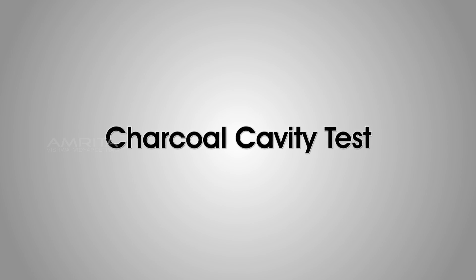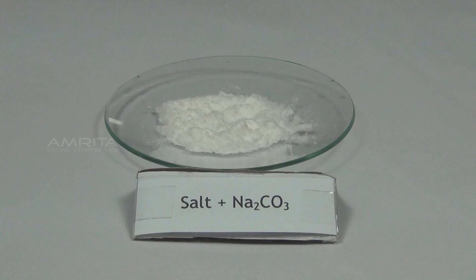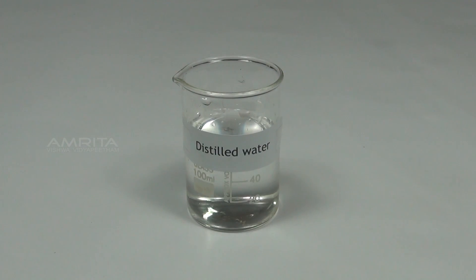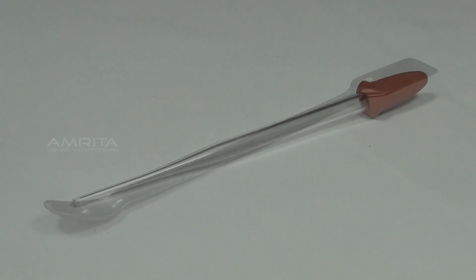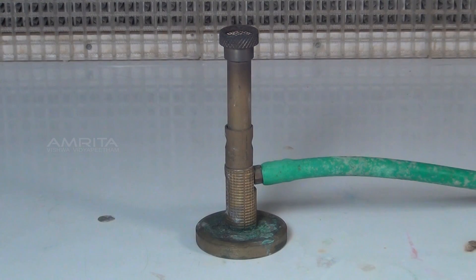Charcoal cavity test. Materials required: mixture of salt and sodium carbonate in a watch glass, charcoal piece, distilled water, spatula, dropper, tongs, blow pipe, and Bunsen burner.